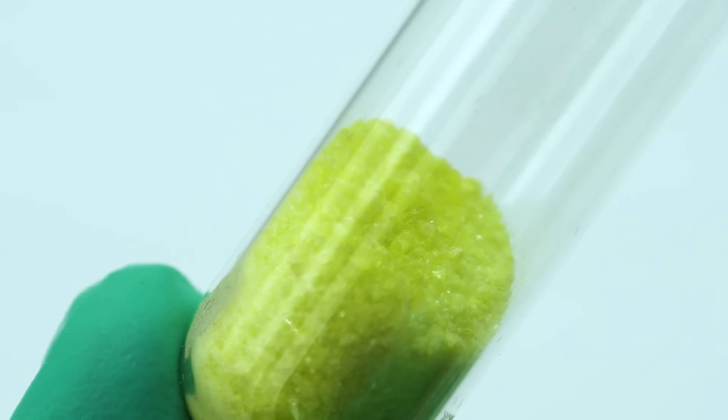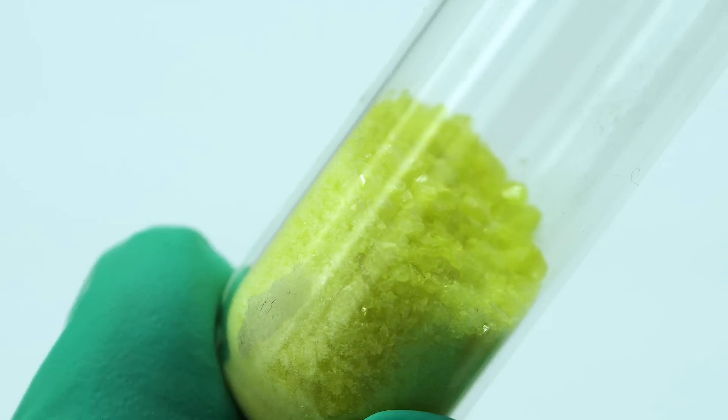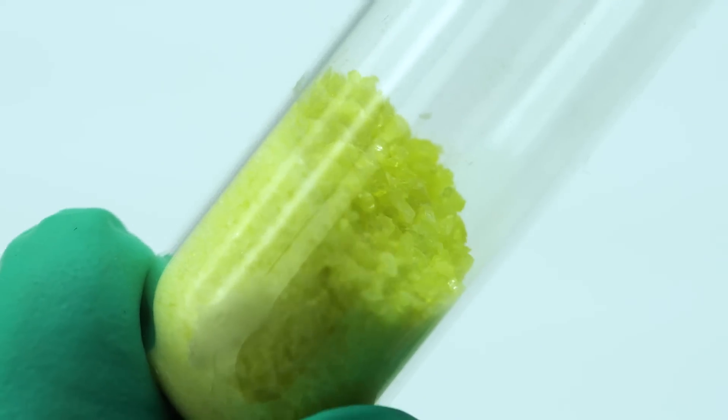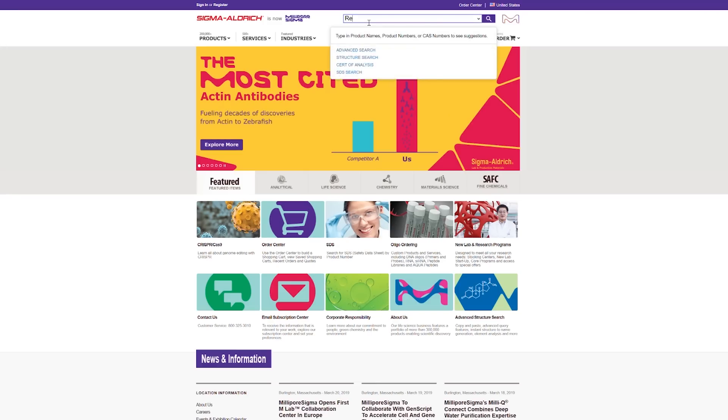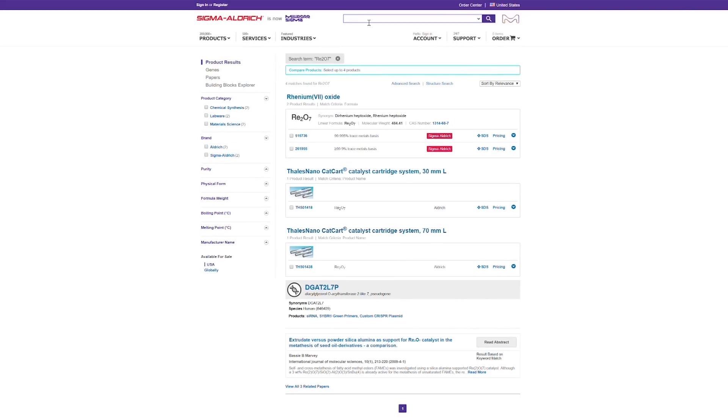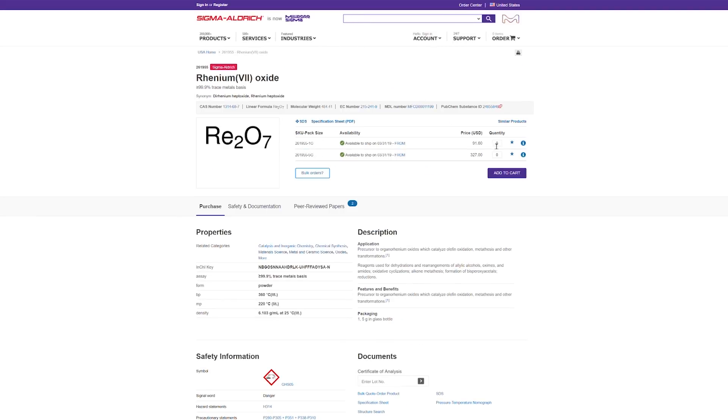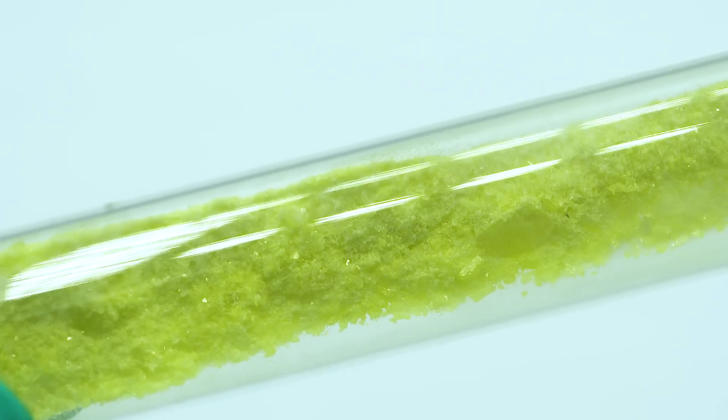Rhenium Heptoxide is the oxide of one of the rarest metals called Rhenium. This compound is rhombic crystals of lemon-yellow color. This is a volatile solid matter that is easy to deliquesce in the air. It's a very rare and expensive chemical reagent. Sigma Aldrich sells it for about $100 per gram. My sample in a sealed glass ampoule contains 10 grams of Rhenium Heptoxide.